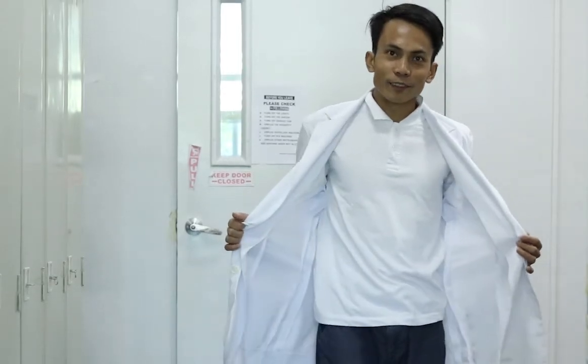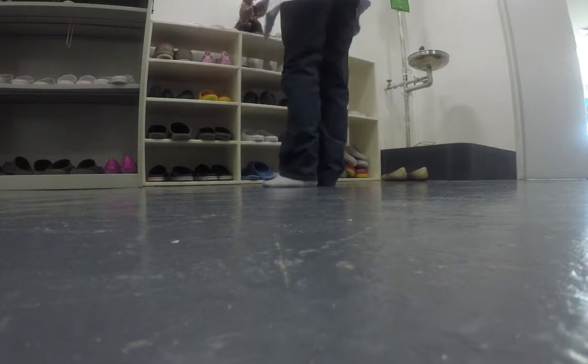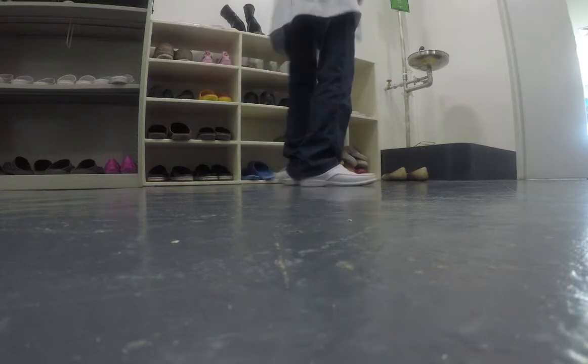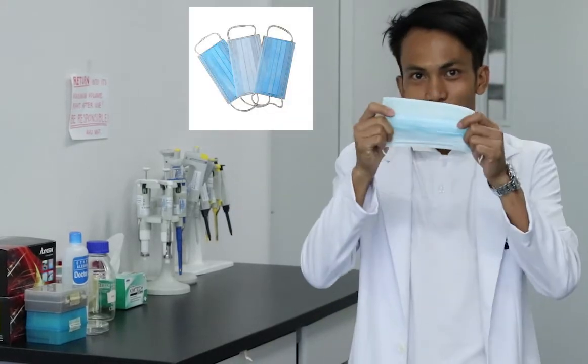For your personal safety, always wear laboratory gown. Simula sa mga laboratory, kailangan nating mag-wear ng gloves and of course, face masks.